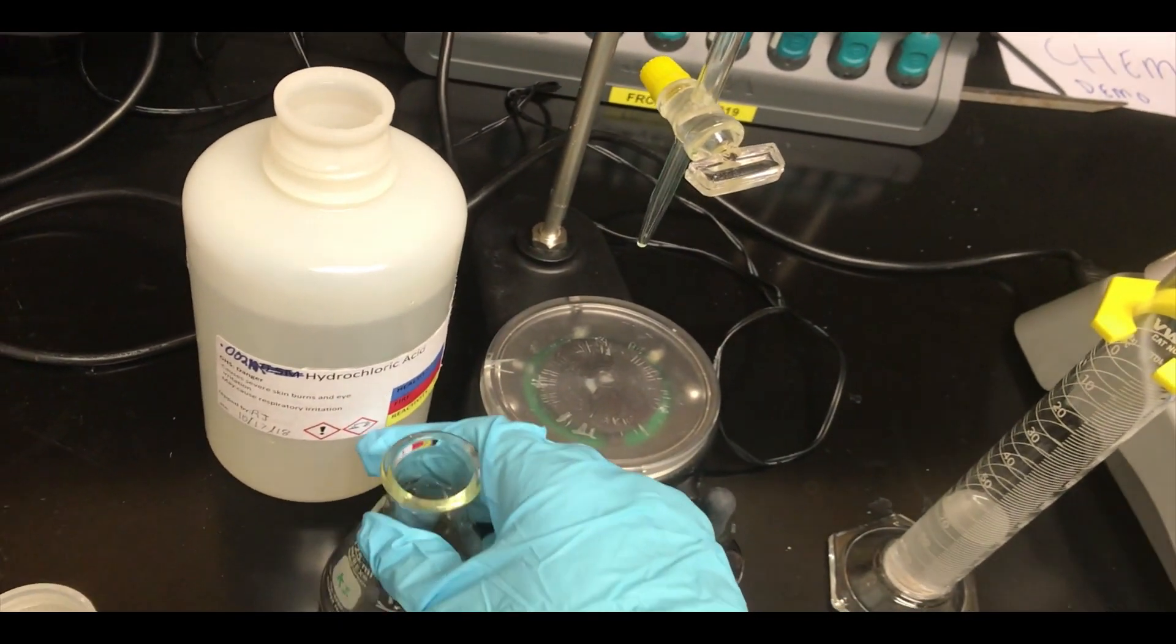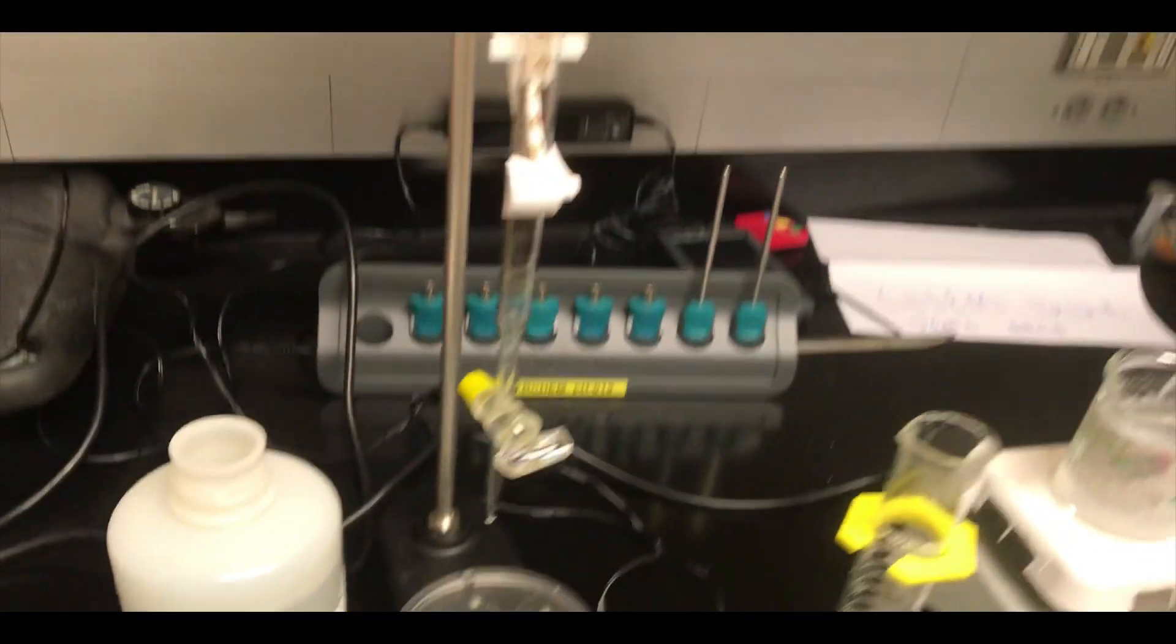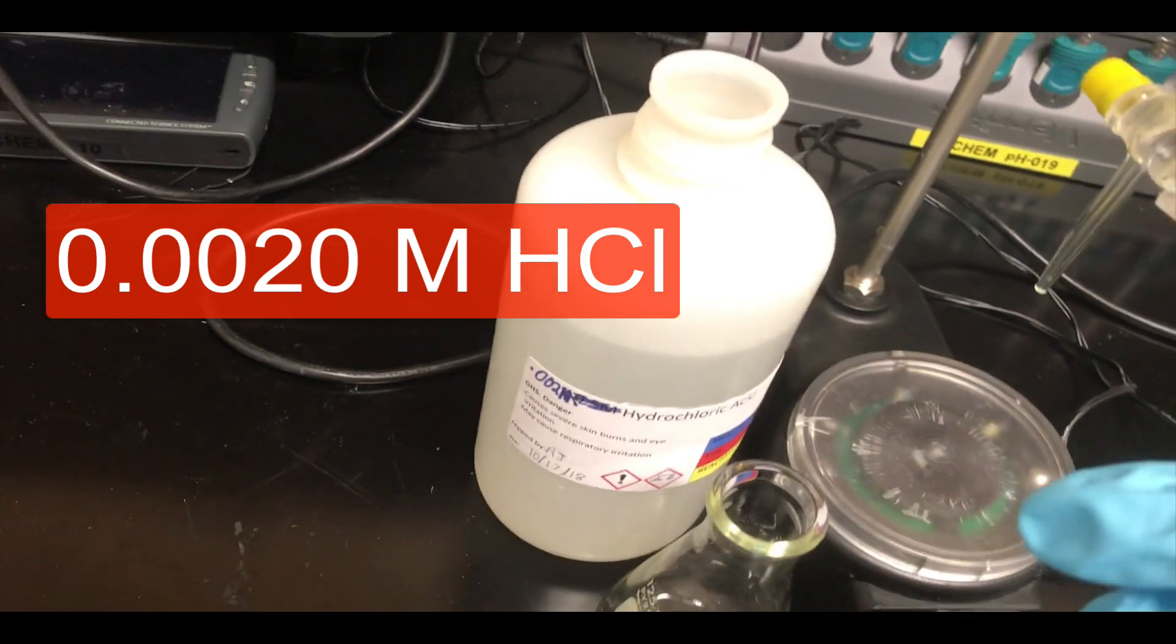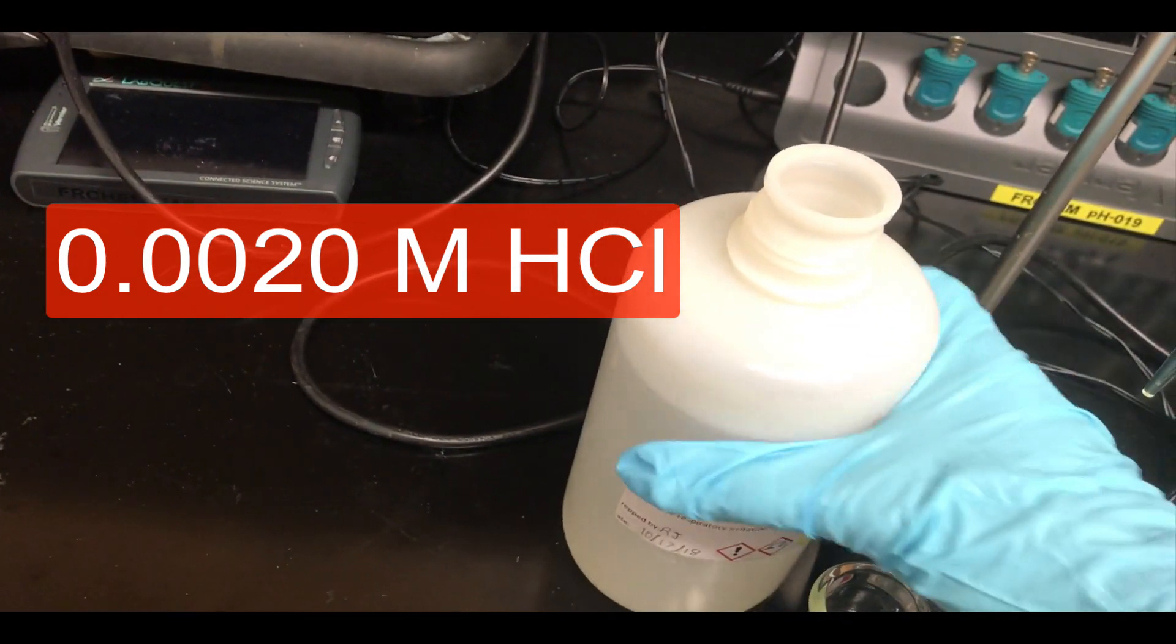So we're going to transfer this into our titration flask, a 125 milliliter Erlenmeyer flask, and then titrate it using hydrochloric acid, 0.002 molar hydrochloric acid. You're actually going to prepare this yourself via dilution. So I'm going to go ahead and fill up the burette, and we'll start the titration.